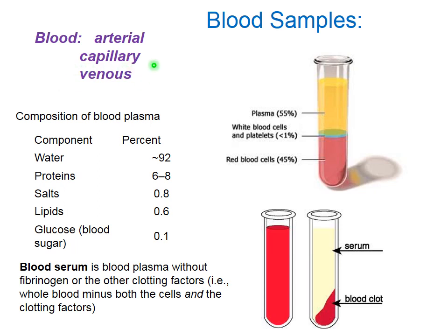Now, we can process whole blood, so all the cells, all proteins, all compounds taken together. Very difficult to handle because it will coagulate on standing. But sometimes, yes, it would be necessary. Sometimes we specifically need to analyze cells in blood. That's separate.